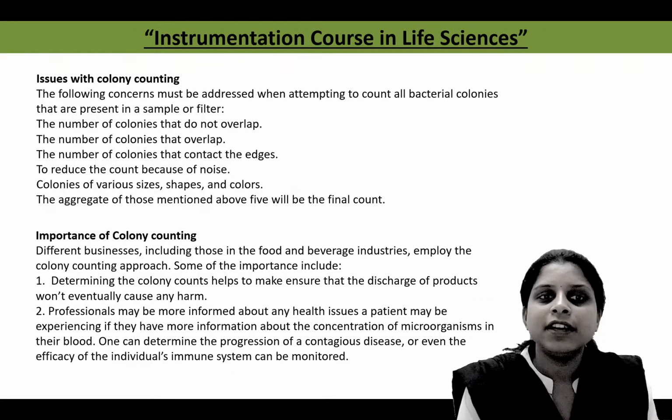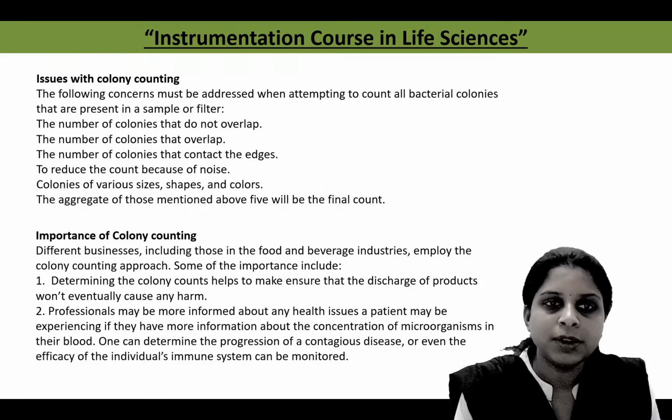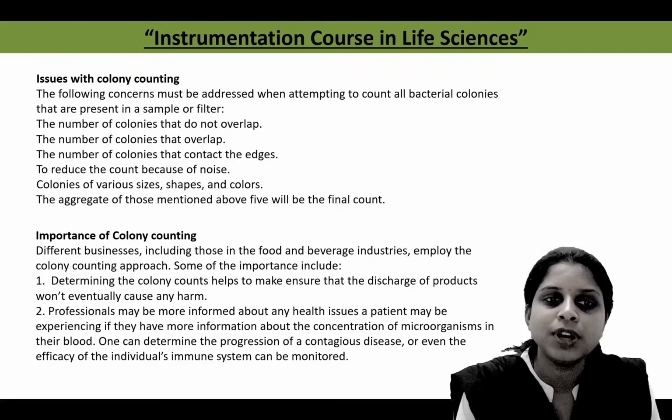Next, there are some issues with colony counting, or some care that has to be taken during colony counting. First, count the number of colonies that do not overlap, so that during counting one colony is not counted repeatedly. The colonies that contact the edges are also counted.